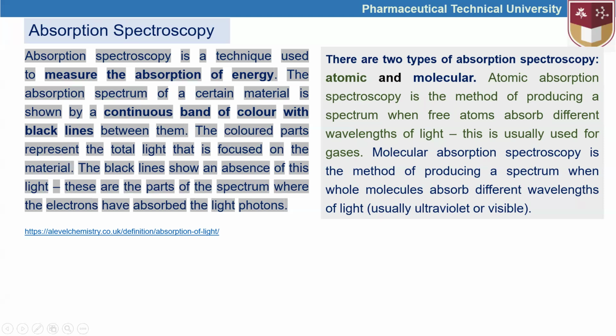Some closer to the ultraviolet range of the visible spectrum can be used more often, but in UV-visible spectroscopy, the range around red, orange, or yellow is not of very high significance compared to ultraviolet or violet-blue colors.